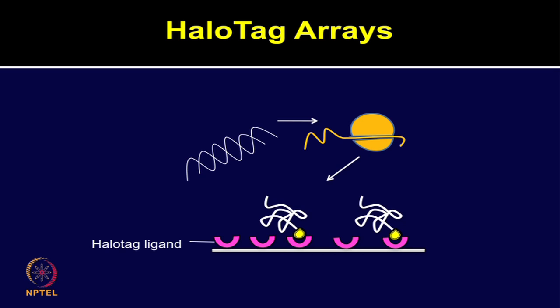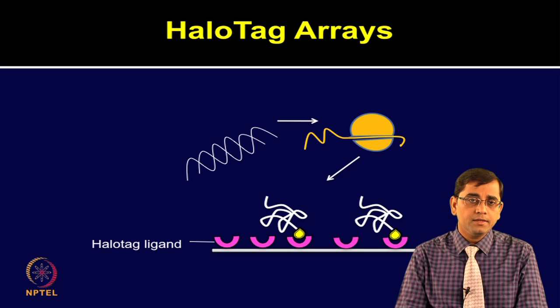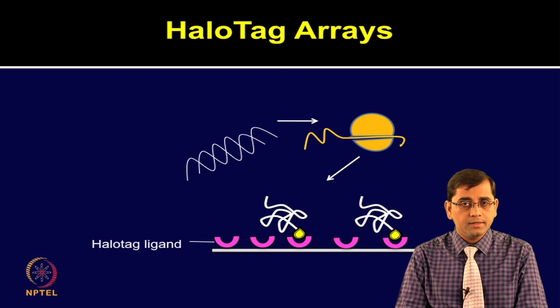In a nutshell, the halotag fused protein is expressed as can be seen here and covalently captured on PEG coated slide, and activation is performed by using halotag ligand. This provides very strong covalent interaction and minimizes loss of synthesized protein, which usually occurs in other protein microarray based methods.